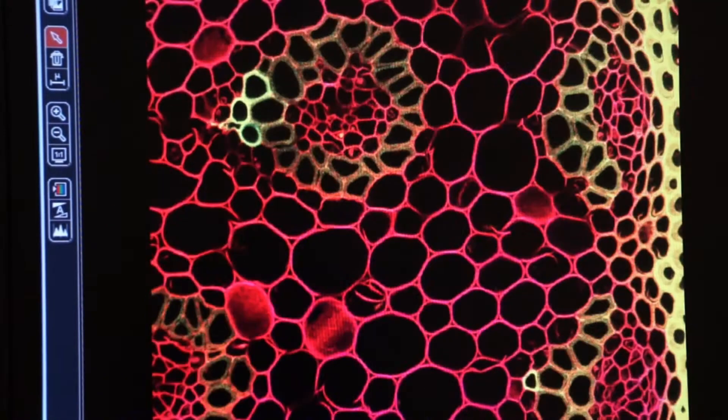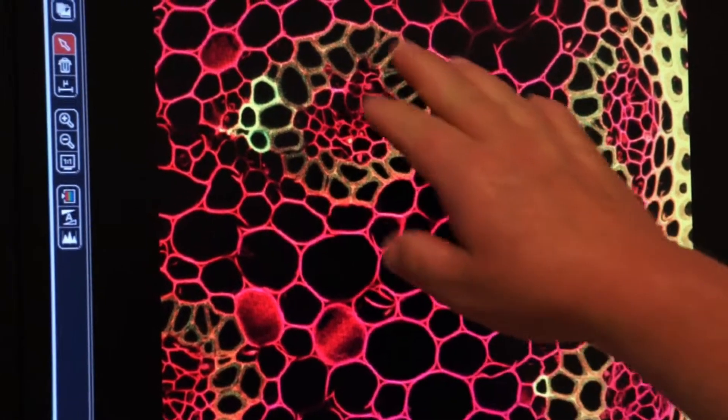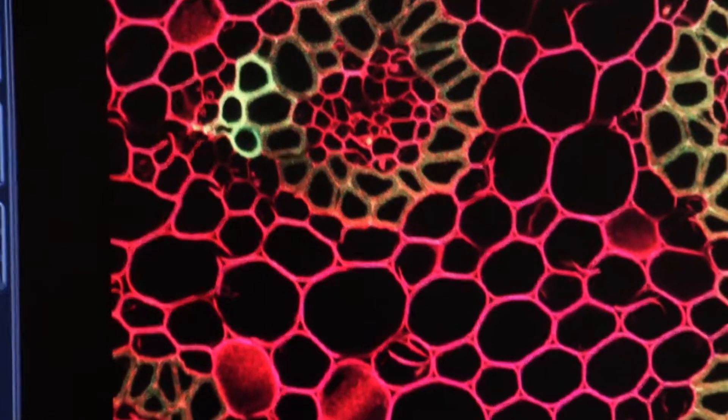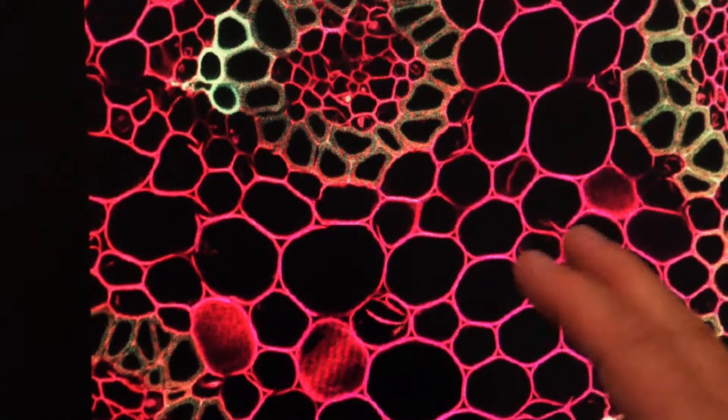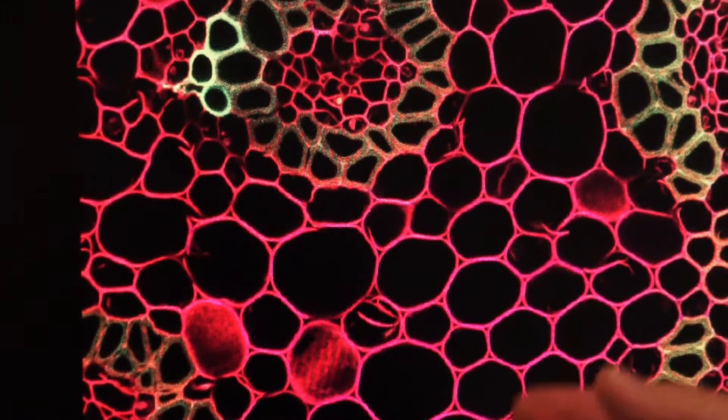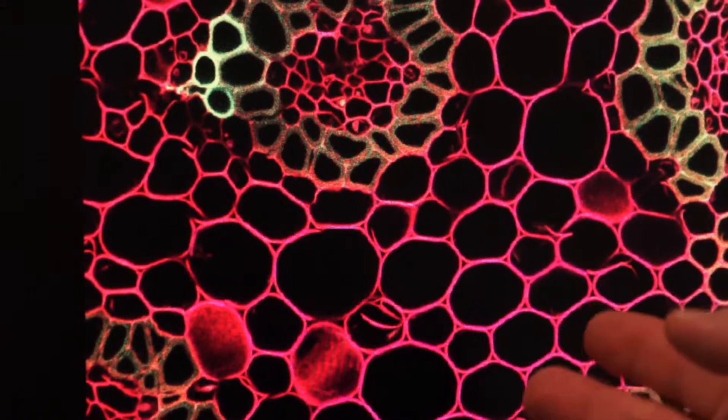If we look on our composite image you see now a lot of that pixelation has gone away. So by increasing the resolution of our digitizer and increasing the line averaging we get a cleaner image.